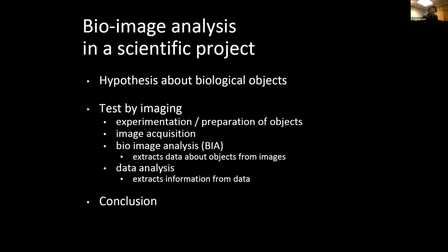To do that, you will experiment, prepare the objects, acquire the images with microscopes or scanners, and then apply some bioimage analysis. You will extract some data about the objects, and then analyze this data to extract relevant information for testing your hypothesis. Then you can conclude. It's a typical research workflow for bioimage analysis.